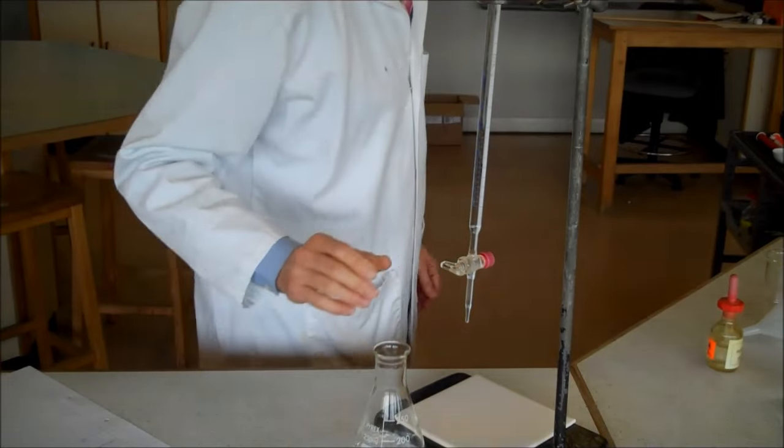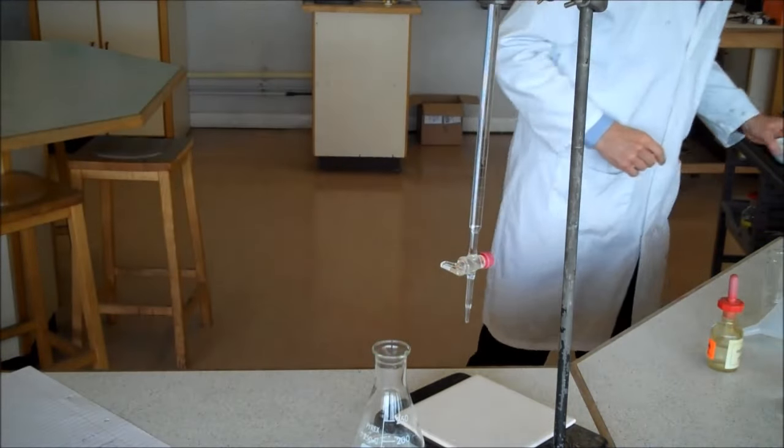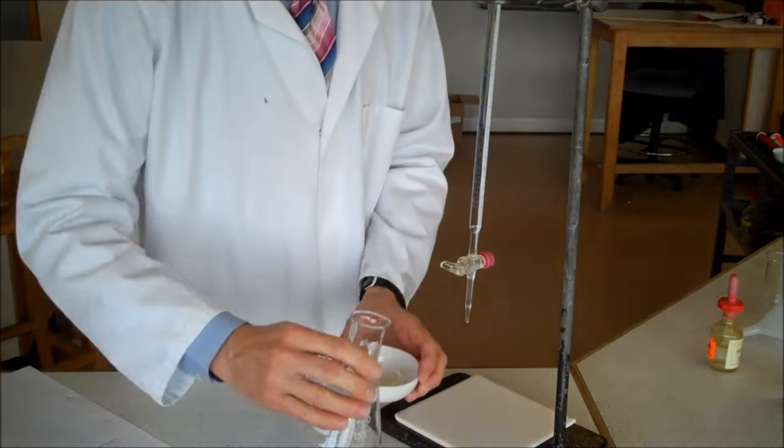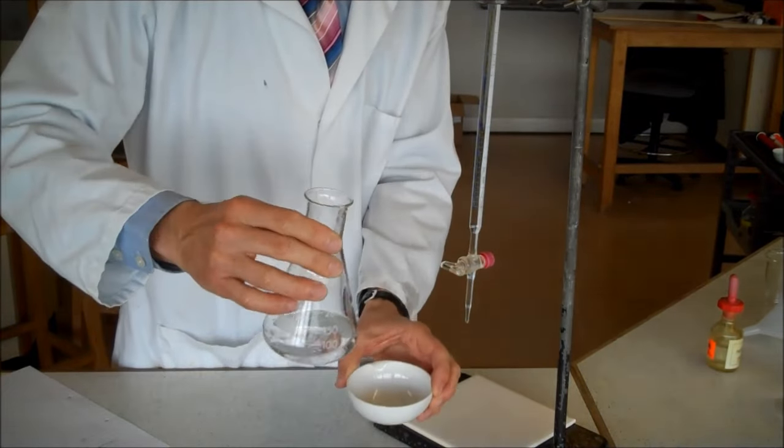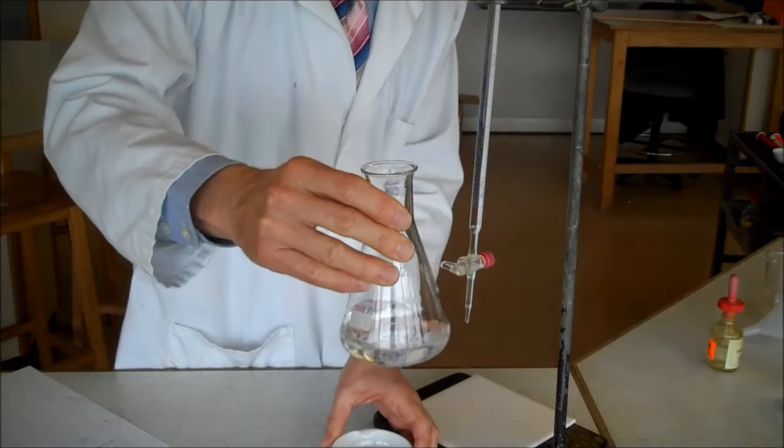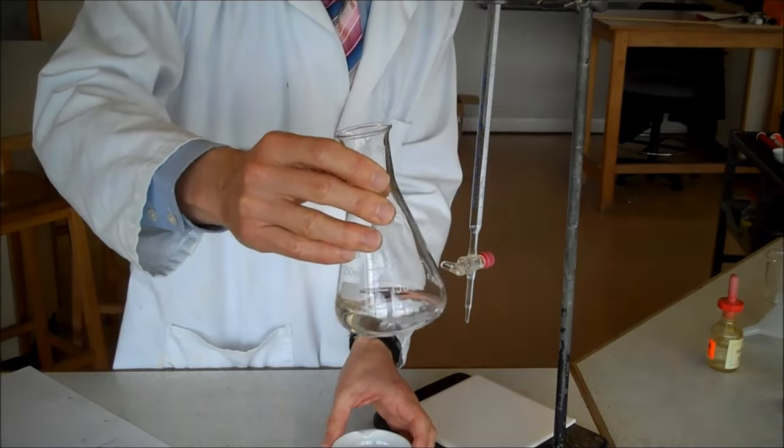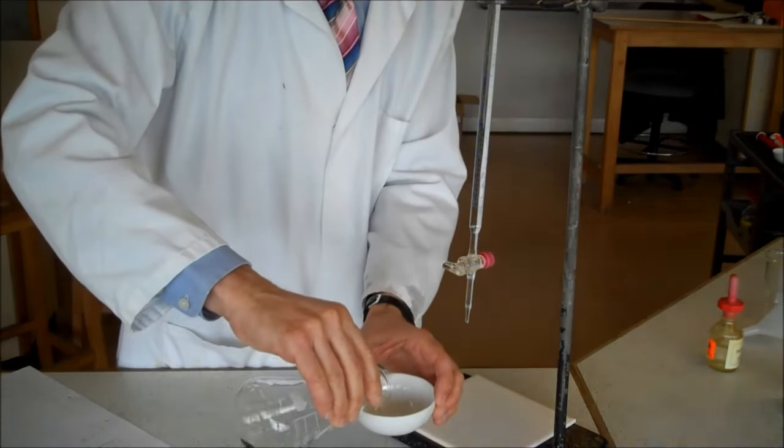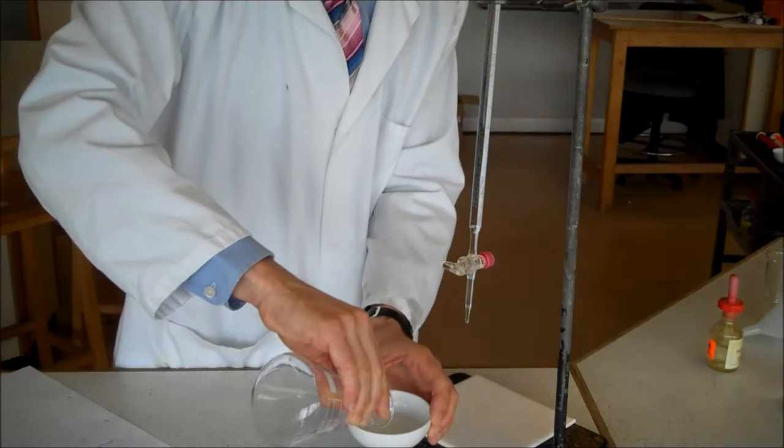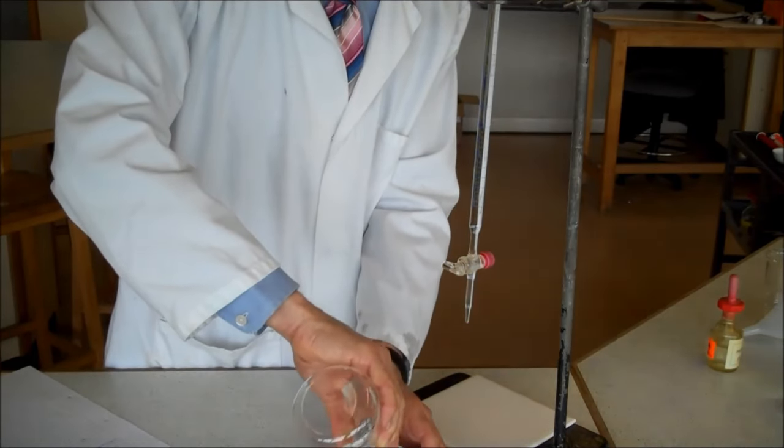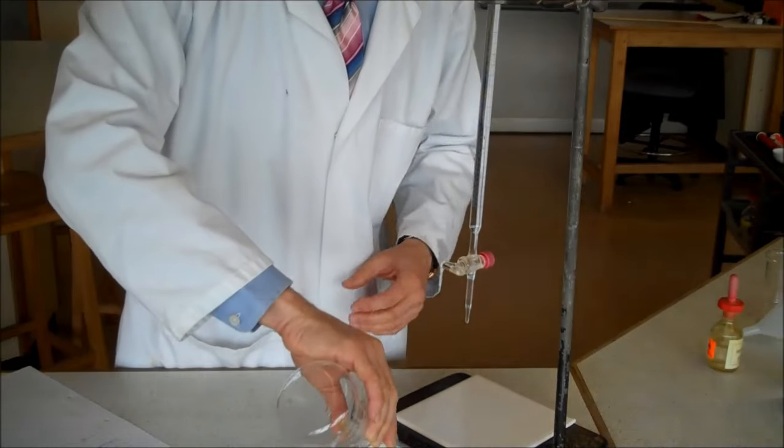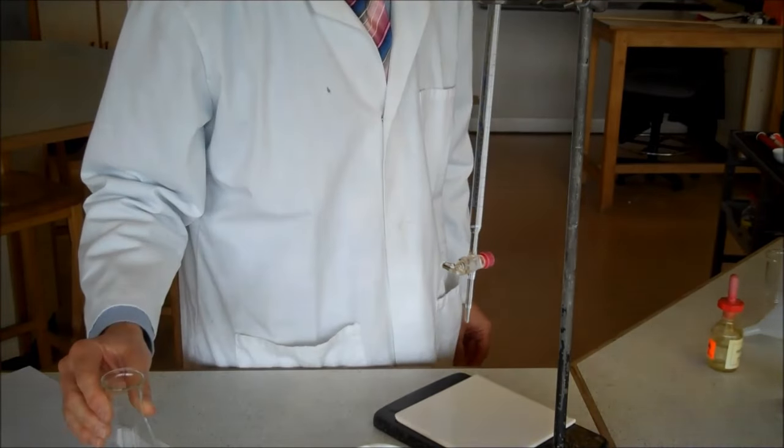Step three is we're going to evaporate off all the water. Notice the solution is completely clear. There's no need to filter this. It's completely clear. We pour it into an evaporating basin. And the last thing we want to do now is to warm up the liquid to evaporate off the water.